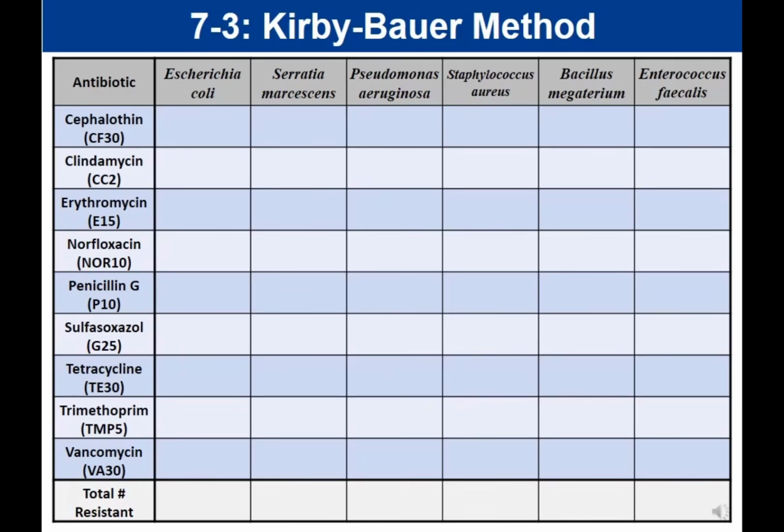So again, you don't have to memorize which drugs are broad and narrow, but if given the data, or given plates labeled with S's and R's, you should be able to look and say, well, with that drug, in every case the bacteria is sensitive. So that's broad spectrum. If you only see some of them being affected, then that's narrow spectrum. Again, don't memorize this table. You don't need to get bogged down with that detail, but you want to understand what those plates tell you.